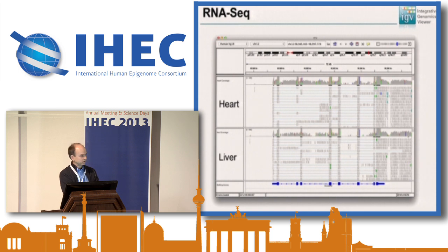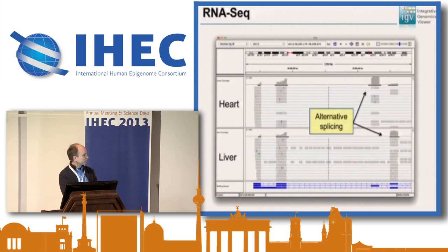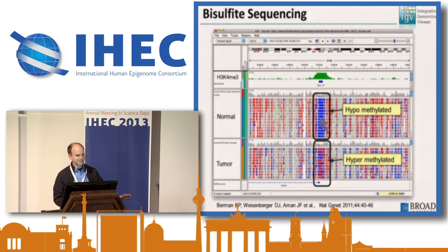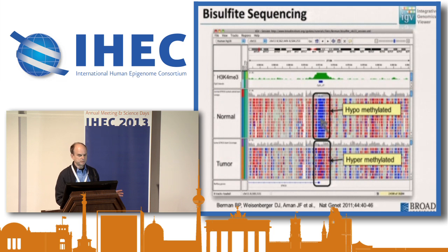RNA-seq is similar but has a different look because of all the splicing going on — this is heart and liver from BodyMap data. One thing you can see in RNA that you can't in DNA is alternative splicing, illustrated here between these two samples. Finally, bisulfite sequencing. IGV has a special coloring mode which understands the C-to-T conversion, so you don't have a false impression of many SNPs. The red and blue show individual base information — the raw data of where a C or T was expected. You can also set it for different contexts beyond CpG, such as for plants.